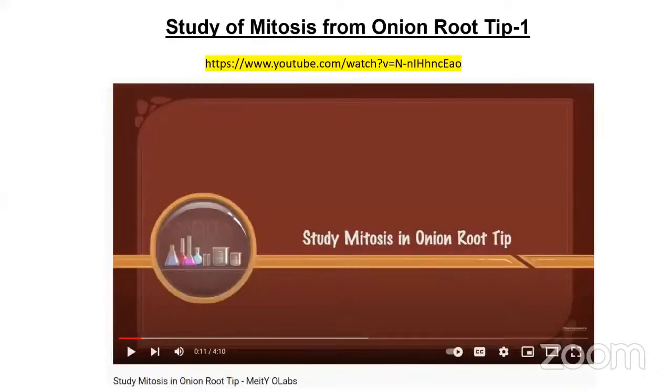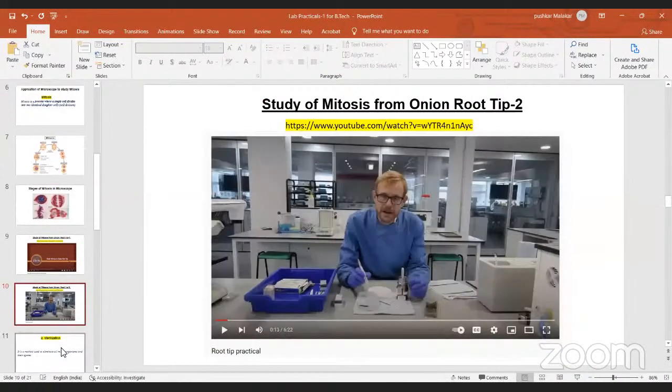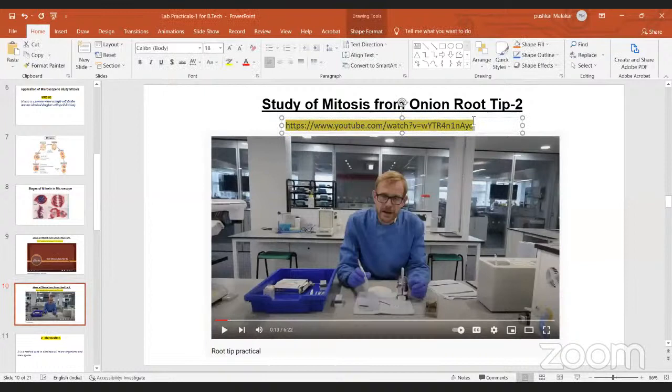So let's see one more video which will make the process understanding better. Okay, so this video is also for studying the mitosis in the root tip. So let's see.